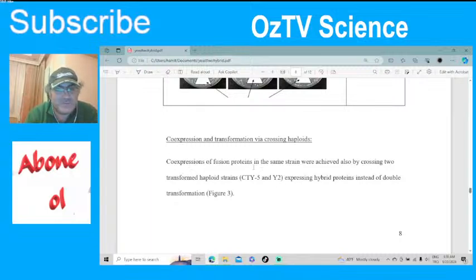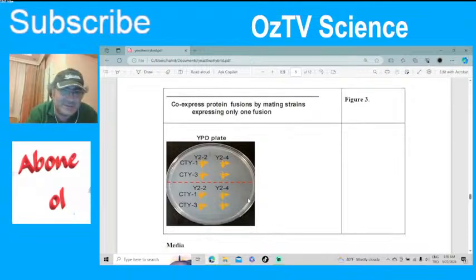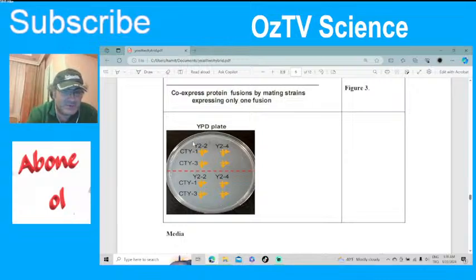So co-expression of fusion proteins in the same strain was achieved by crossing two transformed haploid strains. If you put two plasmids into different haploids and then make a diploid, then in the next figure, now we have the diploid. These are the diploids. So when you cross them, the Y2 is a haploid, CTY is another haploid. When you cross them, depending on the proteins they have, you should have the working combination.